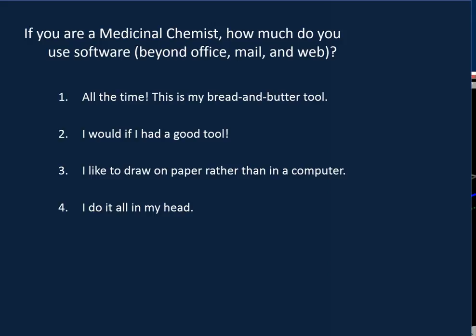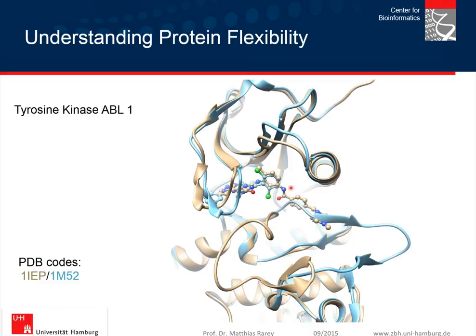All right. Okay, so let's go on. The second topic I would like to talk about is aligning binding sites. This is very new work, which was published just, I think, two months ago now. I will briefly show you what the problems are and how we address them.